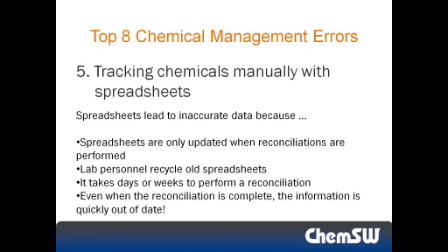If the spreadsheets are only updated every so often, if at all, how will anyone ever know if the limits are exceeding the fire code? And if there's an emergency, how would you ever be able to tell first responders what is truly in that building or in that lab?